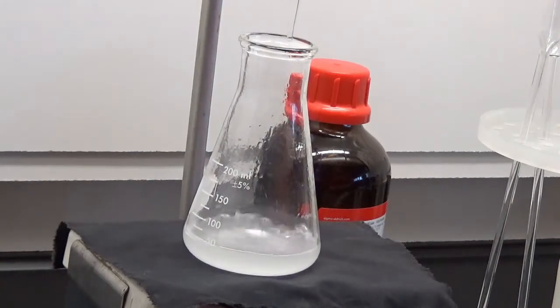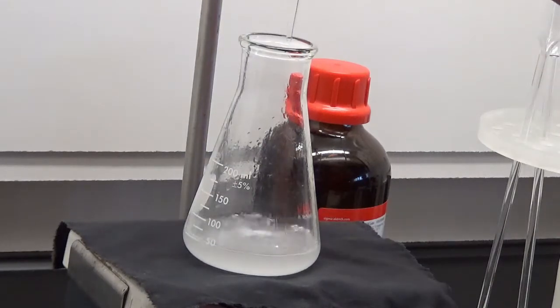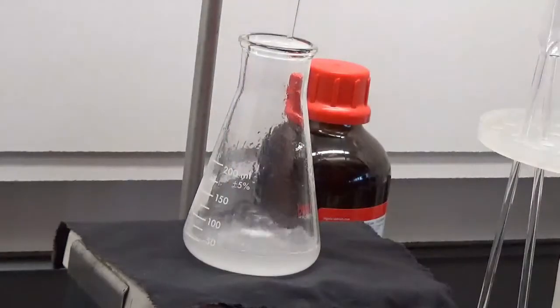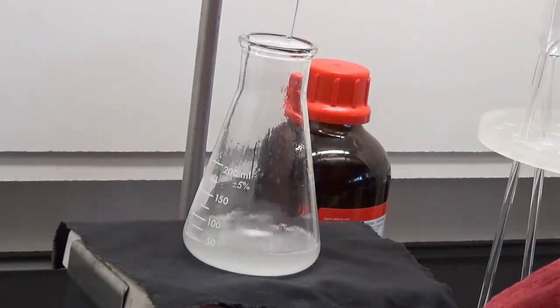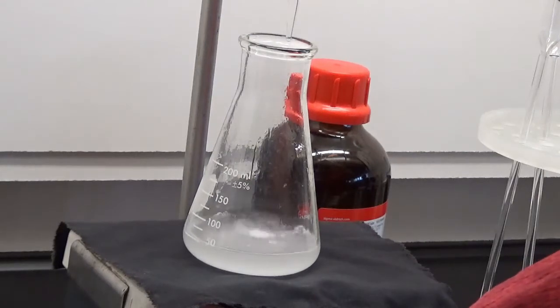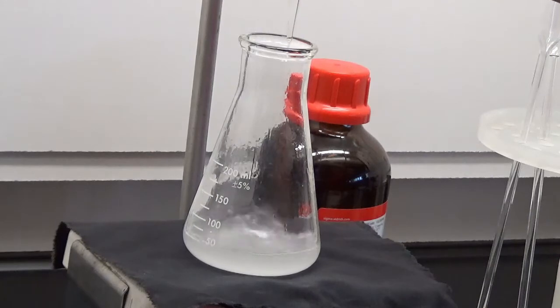Oops, that's a whole lot of drops. Still cloudy. Good. Dodged a bullet there. Tighten this a little. Too much. Another bunch of drops. But I actually haven't even added a milliliter since the last reading. Try to be careful because I'm going too fast.